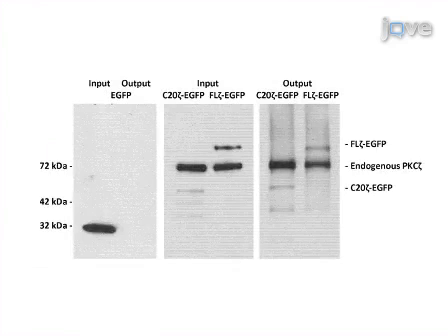Demonstrated results use SDS-PAGE Western blotting to show LIMACS purification of endogenous and recombinant atypical PKC and a specific ceramide binding domain expressed in MDCK cells.